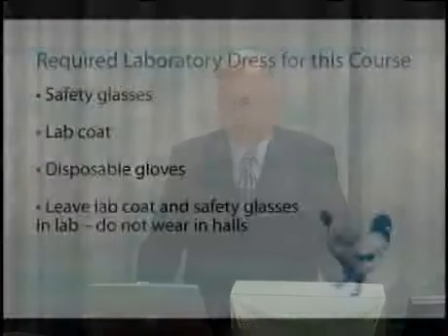And we've had some experiences where not all respirators will fit all people. So if your face is narrow, you have high cheekbones, these respirators tend to not fit so well. So make sure you have one that works for you.